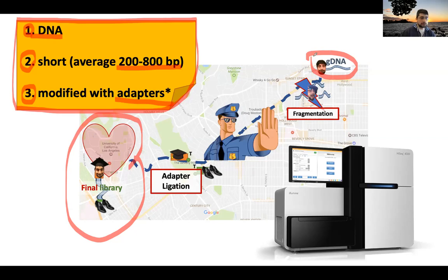We have our DNA, and as you know, the genomic DNA that you extract from cells is huge. It's megabases. The smallest that you can think of is the DNA of viruses, which is still kilobases. For example, the new coronavirus that is creating such a problem right now has a 30 kb genome, even if it's RNA in that case. But in general, viruses are the organisms with the smallest DNA, and it's still kilobases. So we are still one order of magnitude above the limit of the short DNA.